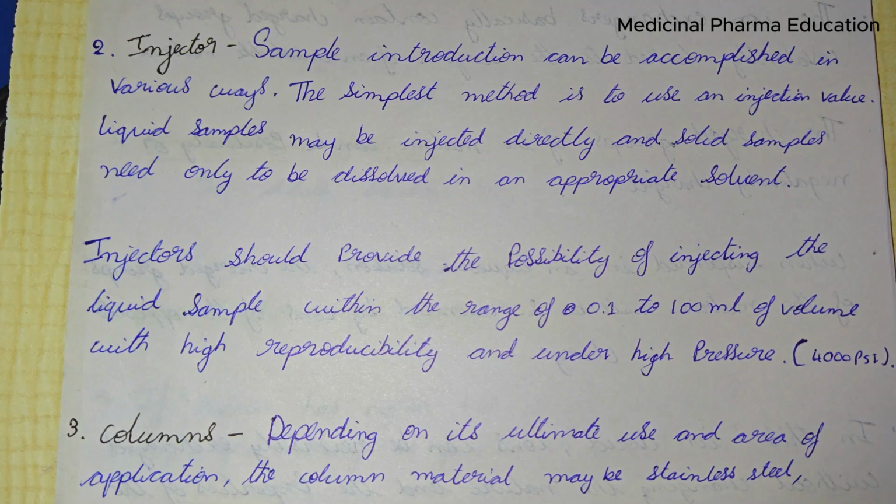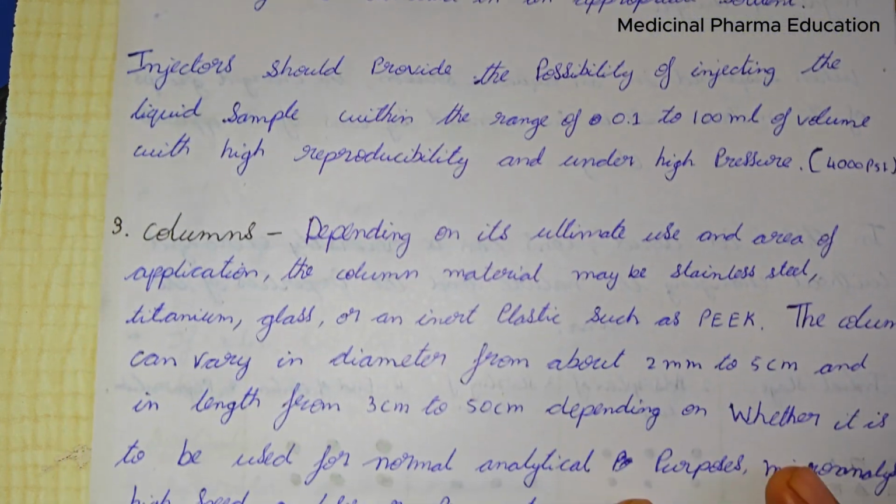If here we have got one result, the next result also should be the same if the same values are used. Okay, under high pressure, and if you are using the pump to send the mobile phase, the pressure also increases. Okay, the injector should also withstand it.